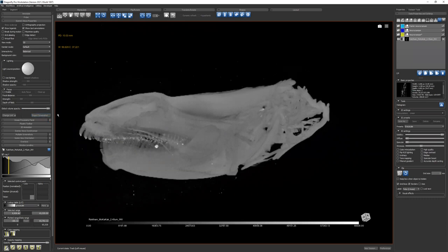They're far away from each other for no good reason. Export screenshot. Then you can change your width and height. I think these are locked. Yeah, so it'll keep the same ratio. And the larger you make it, the higher the quality, the higher the resolution.